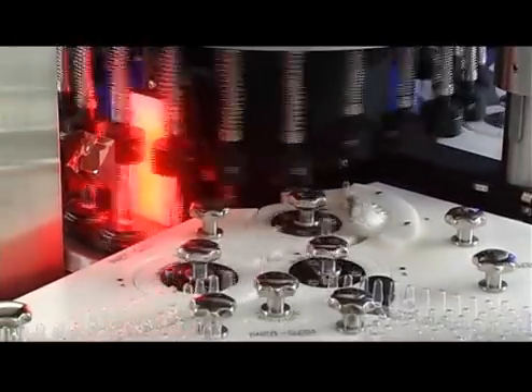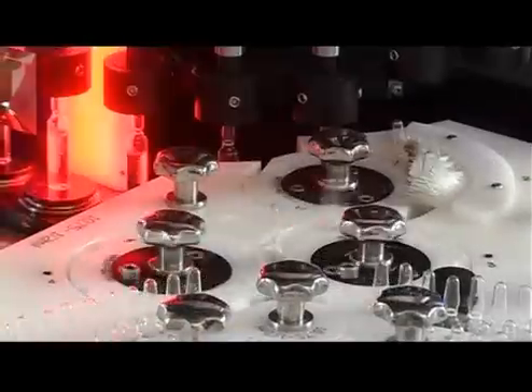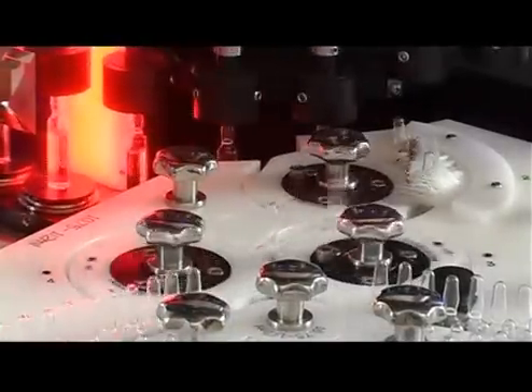From the carousel outlet point, the ampoules are sent to the approved and discarded separation system and collected in containers.